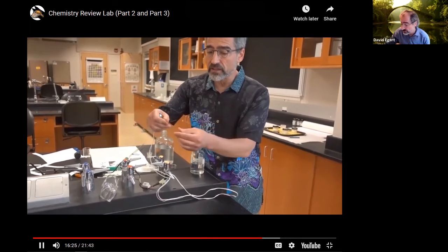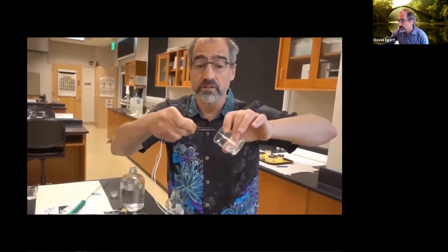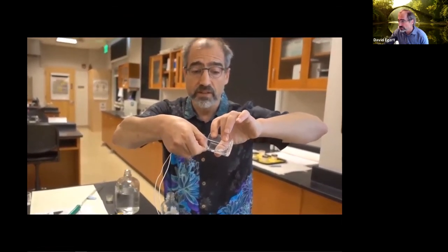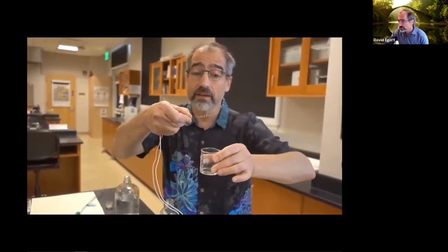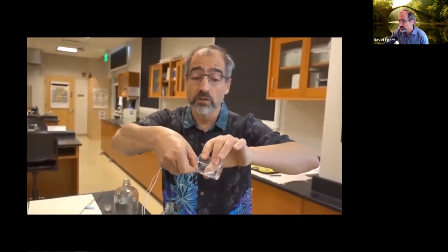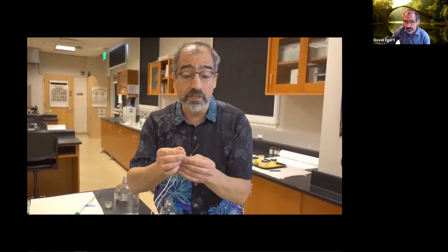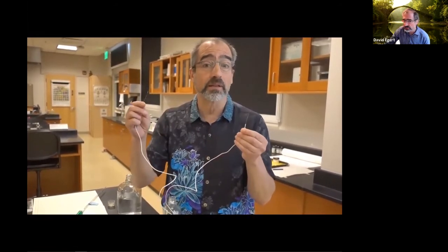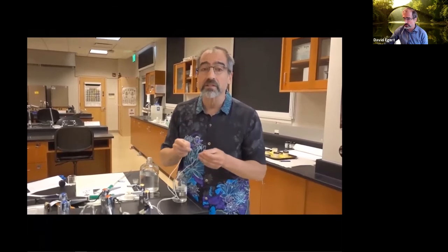Also, they're not touching. And I'm going to submerge them in this mineral oil salt solution and make sure they're fully submerged. And now I don't hear anything. Right? Air, no buzz. Oil and sodium chloride, no buzz. Again, you can double check, fail safe, to make sure the system's actually working. If I touch the wires, I totally hear a buzz. So the system is working. It's just that I did not have an electric current when I was testing in my solution.